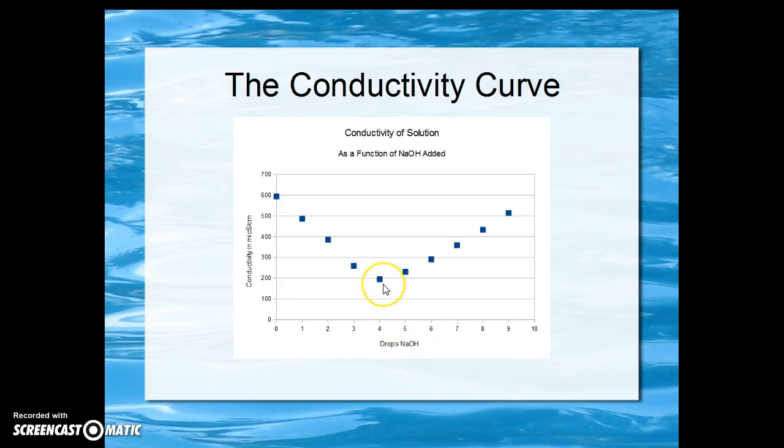As we go past four drops, the conductivity rises in what appears to be a straight line.